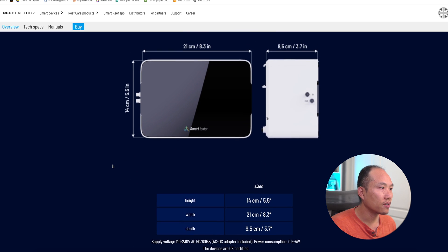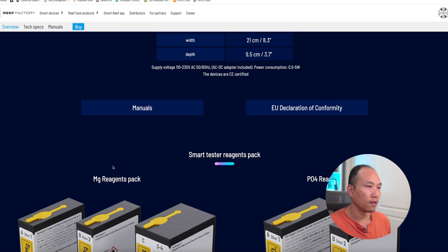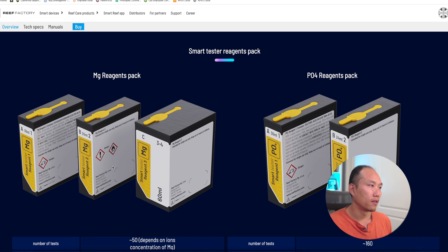The unit measures about 8.3 inches wide, 3.7 inches deep, and 5.5 inches tall — smaller than the Trident, though the Trident measures three parameters while this one measures one at a time. Currently it looks like the magnesium reagent and the phosphate reagent are available, so I'm assuming the nitrate and calcium reagents are still being developed.